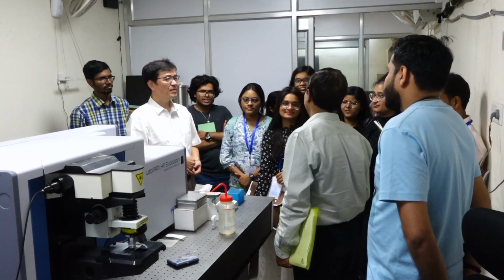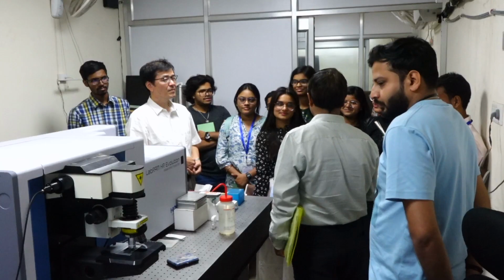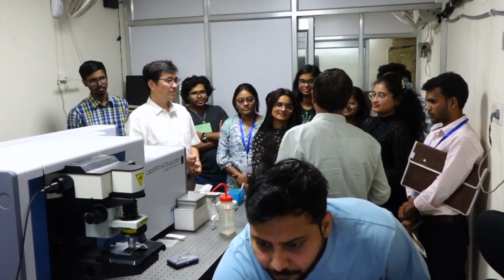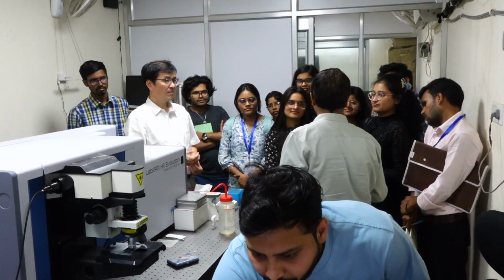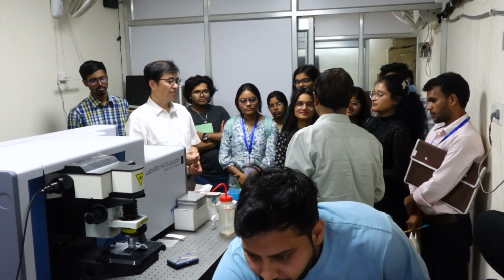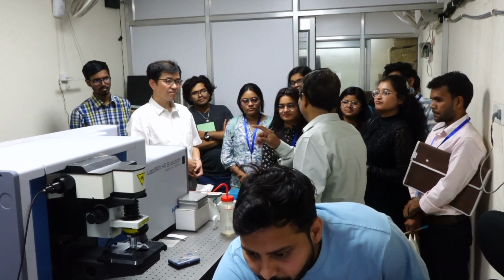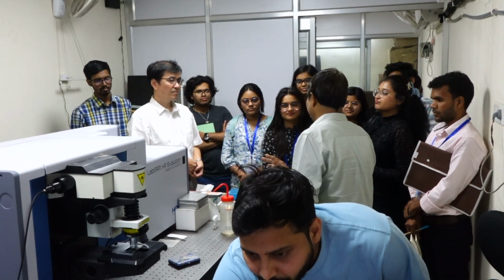See, that is the beauty. We like everything in a black box. They like doing something new. If you have an open system, you can change many things. But here you cannot change many things. Whatever the company wants you to change, you can change that only.